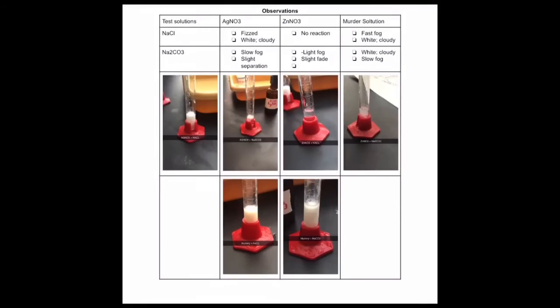Step 22 is to convert the grams to moles using the Stoic chart. Step 23 is to convert the answer to molarity, and step 24 is to narrow down your answer to the murderer. These were the observations recorded during our test.